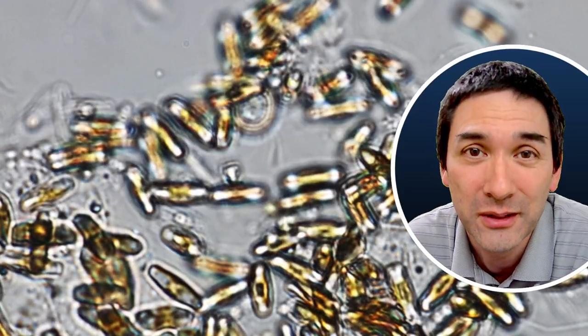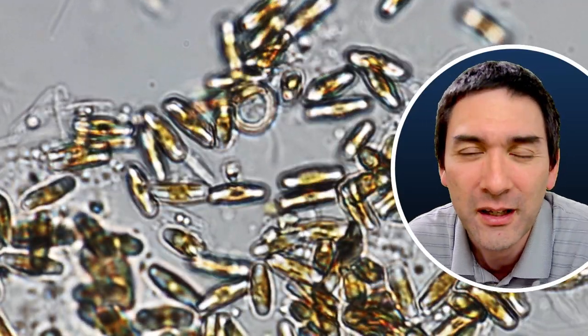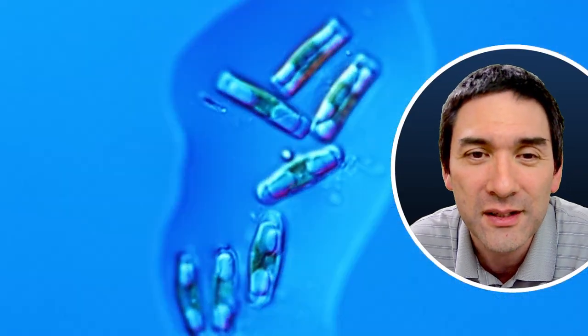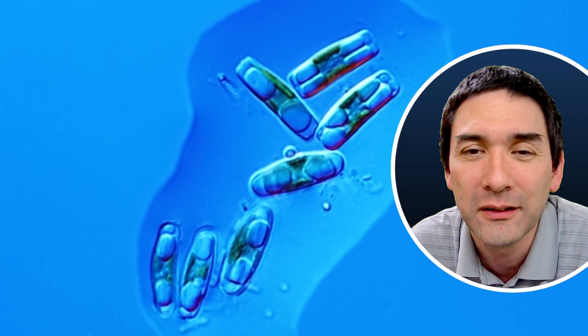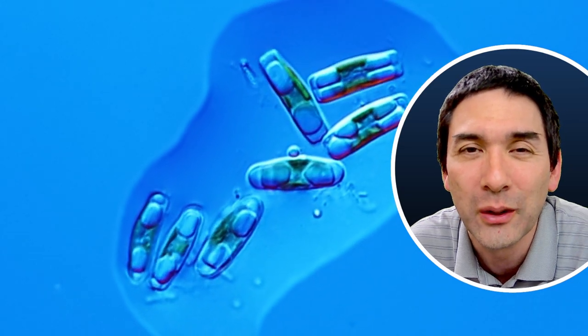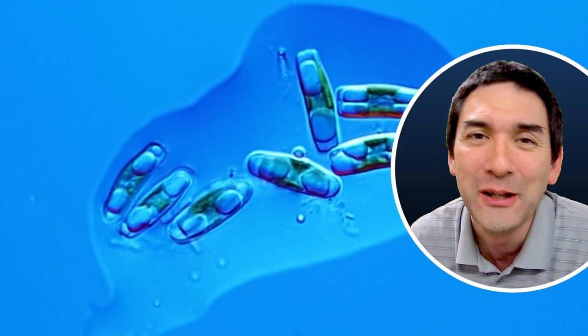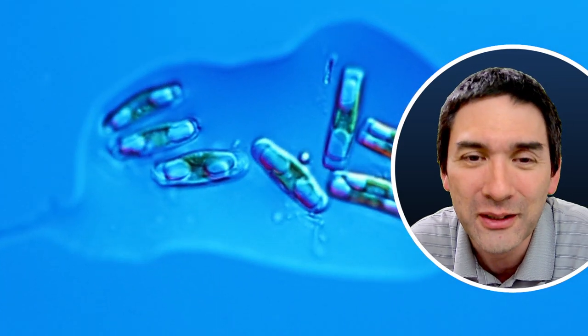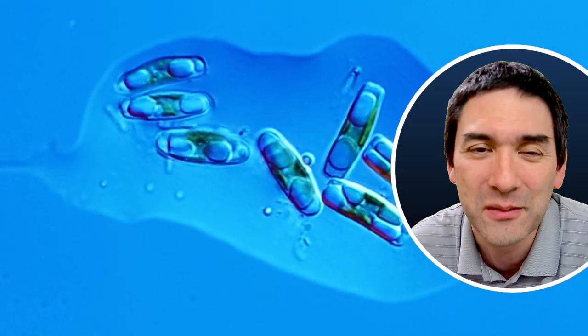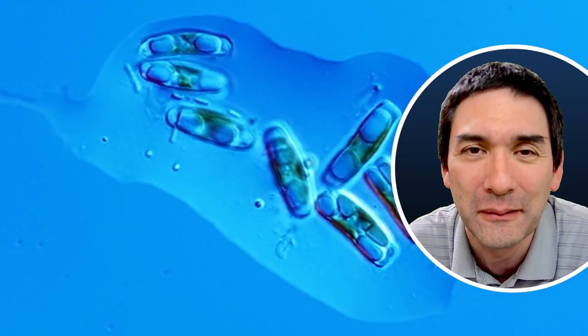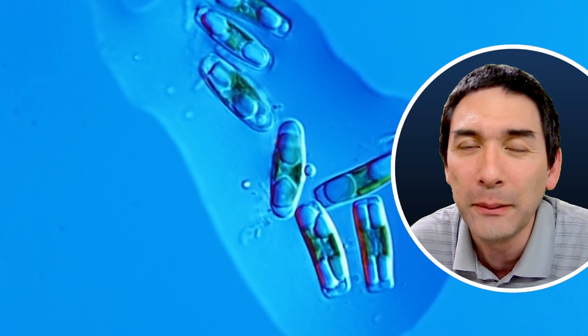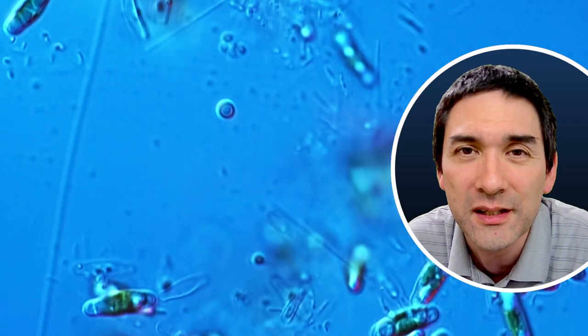This is when I saw a lot of diatoms. Now, diatoms are algae, so they're photosynthesizing. As a matter of fact, they're producing quite a bit of oxygen worldwide. So in that sense, they're quite important here. And I had a closer look at them as well in a small droplet of water into rotation that you see here that I have done with the video editing software. So I did not rotate the slide, but I experimented around a little bit with the video editing software as well. Diatoms were quite plentiful in this biofilm layer.